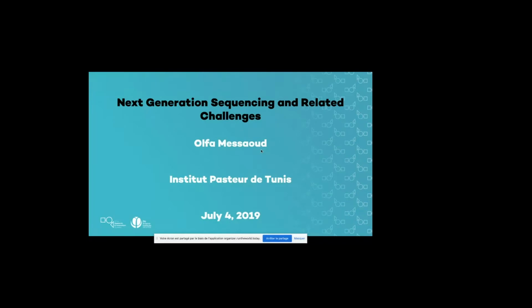So today I'm going to speak about NGS and its related challenges. And as usual, I will try to present concepts in a vulgarized way to simplify and raise awareness of the next generation of researchers to the next generation sequencing and its related challenges.